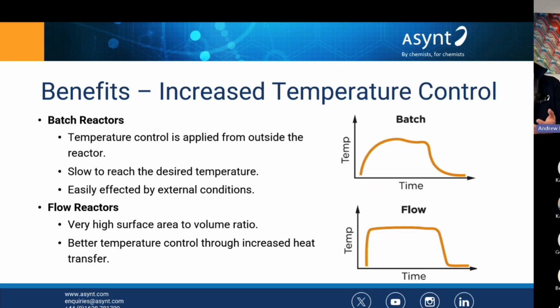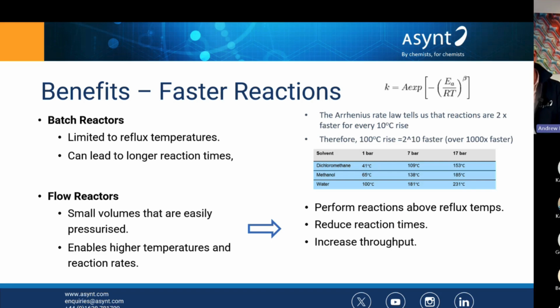So that's heating and mixing and additions, controlling stoichiometry. They're all of those kind of continuous reaction parameters that we can control, and we can automate those very efficiently as well. Adding autosamplers will enable us to look at discontinuous variables, so solvent screening, whether that's a catalyst or an enzyme or reagents or whatever. So I'm going to cover a couple of the benefits.